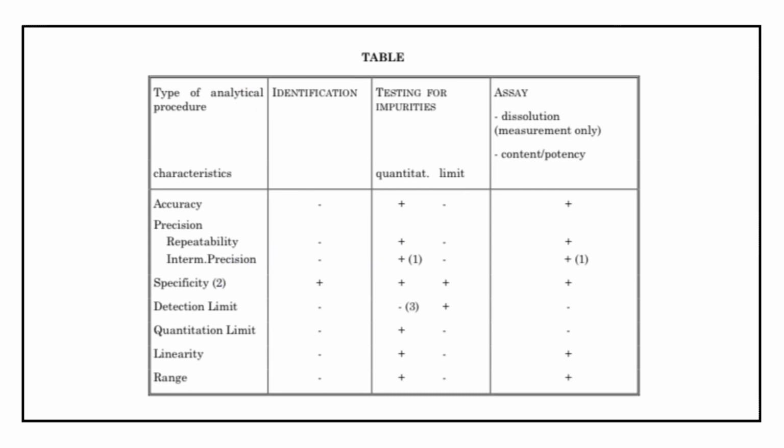But note down one important point, that pharma industry along with the specificity execute 2 more parameters, and those are repeatability and reproducibility. Now let us see all these parameters one by one, how they are executed and what are their acceptance criteria.